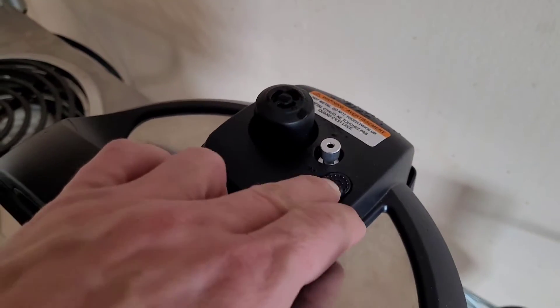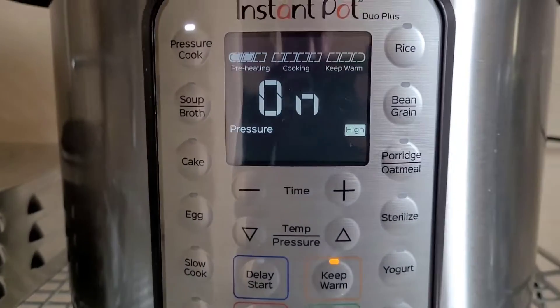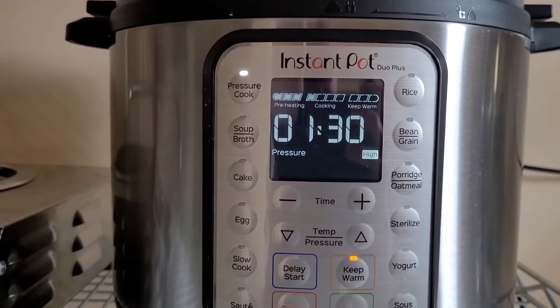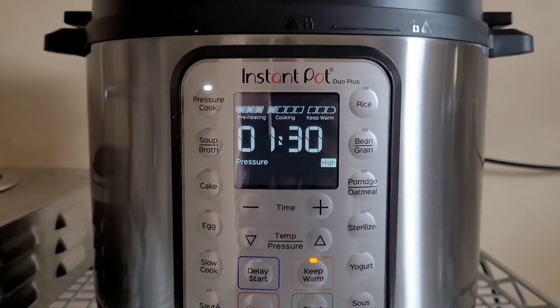The 10 minutes is up. Preheating is complete and now it's on to the 90-minute cycle. See you in an hour and a half.